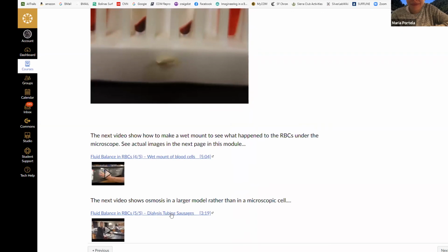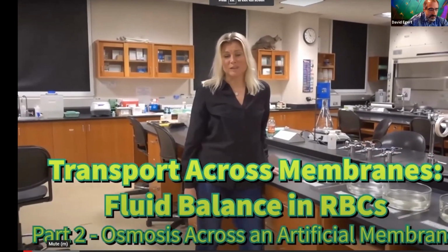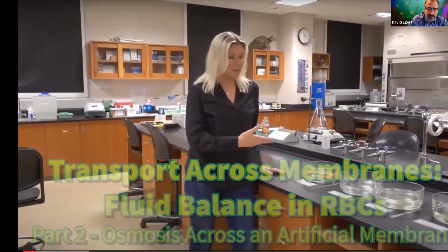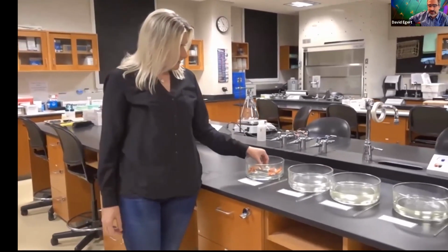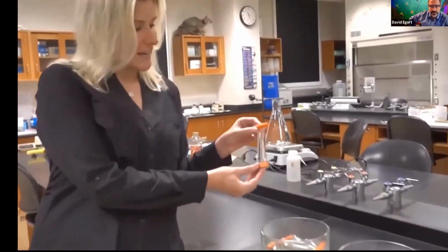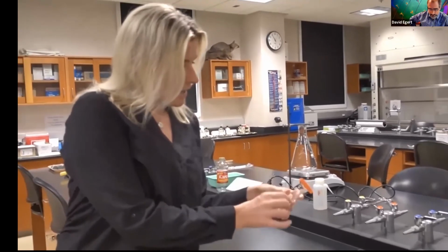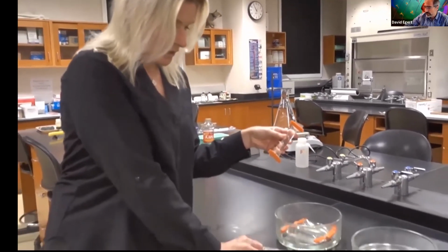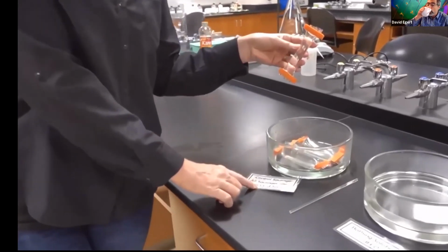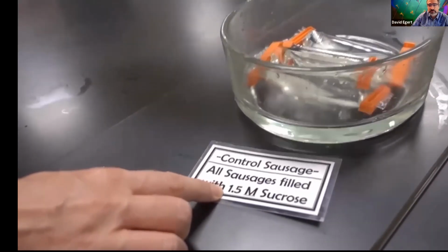All right, the final part of today's lab. We're learning about osmosis and tonicity in this course, and so here we're going to do a demonstration of osmosis. What I have here are 4 sausages made of dialysis tubing. We fill them with 1.5 molar sucrose solution. So all 4 have the same, and they're about the same size.